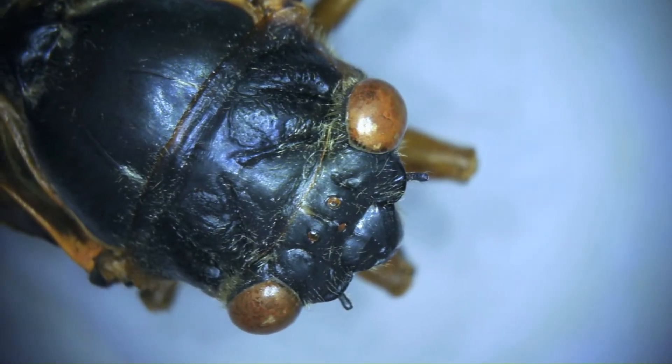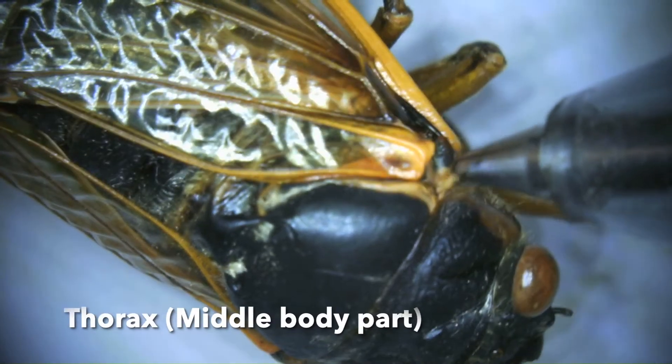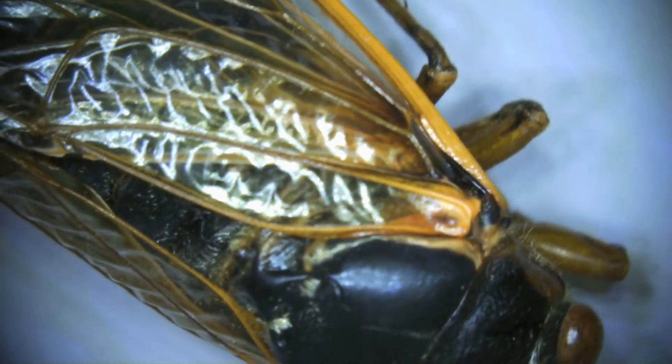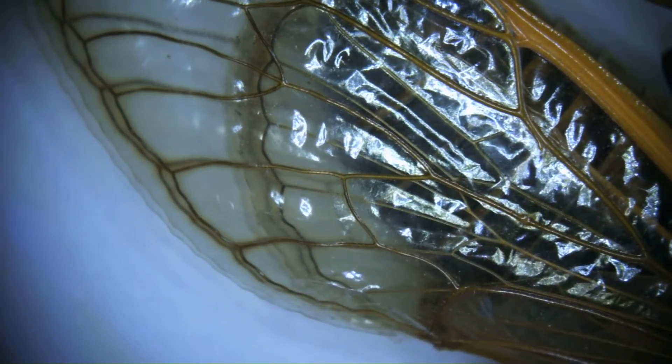Now we move to the thorax, which is our next body part. You can see that's right below the head. That is where the wings attach, as well as the legs — you can see the nubbins of the legs, but those are on the underside.